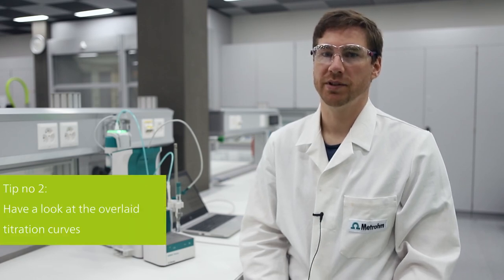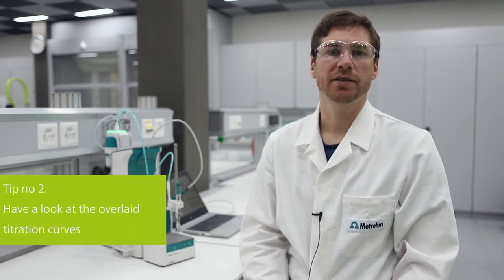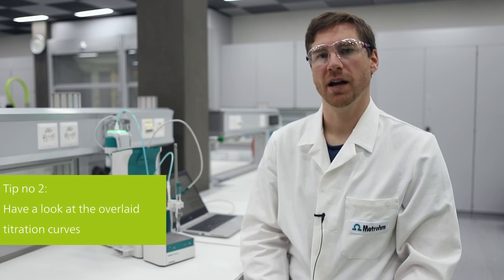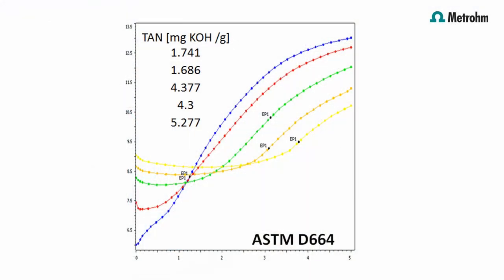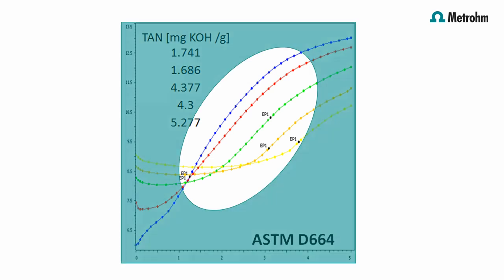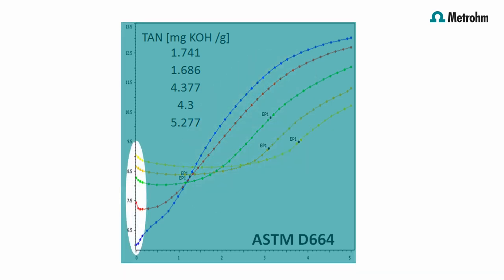In my first tip I said make sure that the rinsing time is long enough, but how do you know if your rinsing time is sufficient? The answer is my tip number two: have a look at the overlay titration curves. Here you can see an acid number determination of used engine oil where the electrode was not sufficiently cleaned between determinations. If you look at the equivalence points, you see them shifting, which is an indication for insufficient cleaning. Also look at the start potential. It should always be the same for the same sample. If not, your cleaning is not good enough.